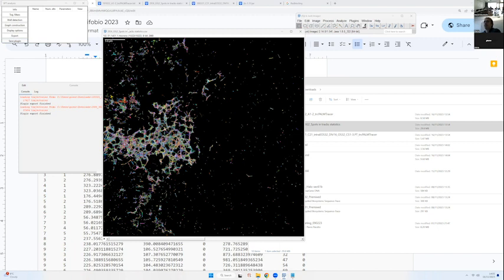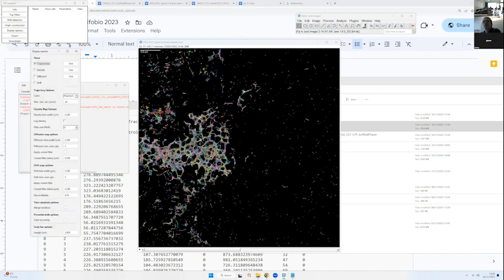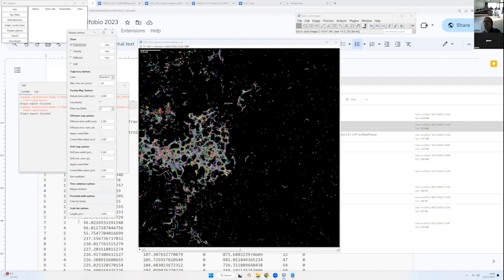Okay, I continue? Yeah. Okay. So let's continue with this file, right? So now these are the trajectories. The first menu we want to look at is the display options menu. It's around the middle of the menus, the display options button. So this opens a large window, and at the top of the window, we can choose what we want to display. So here the trajectories by default are selected.